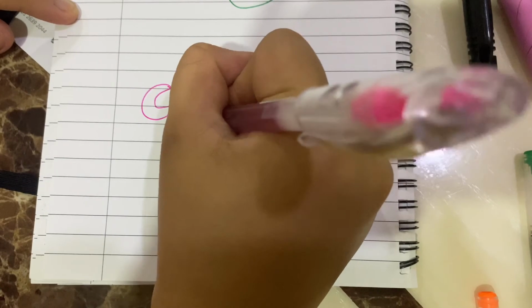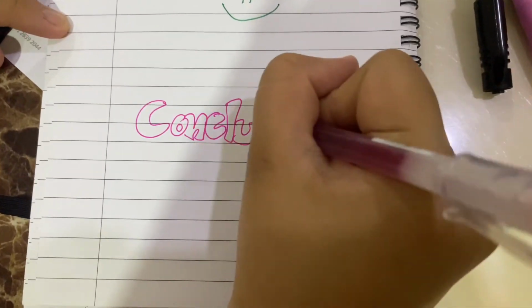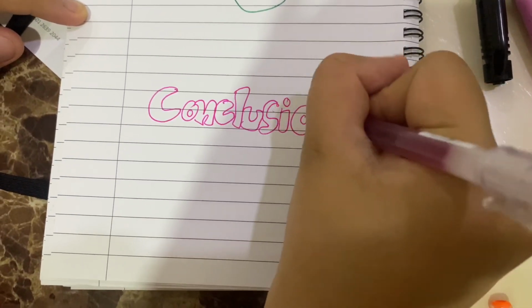As for conclusion, we can conclude that stereo microscope simplifies work for workers in industries.